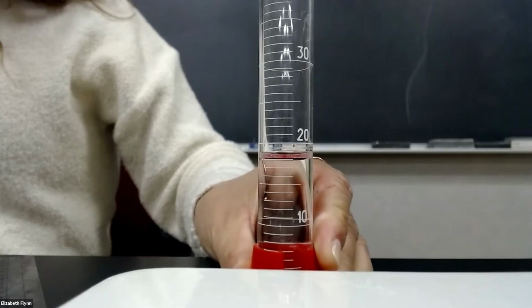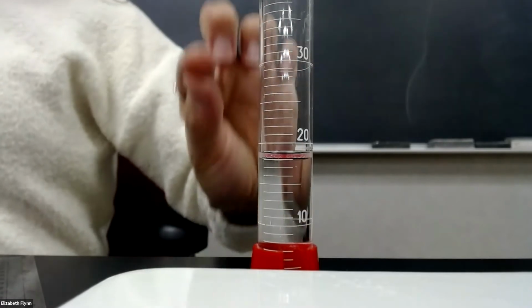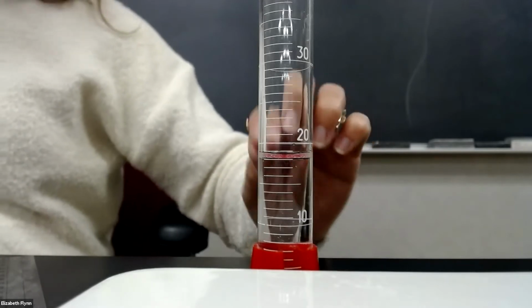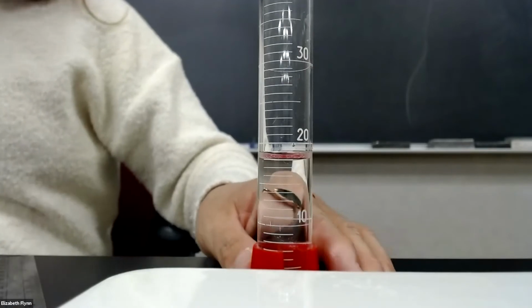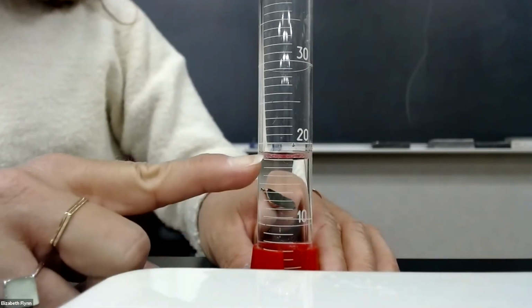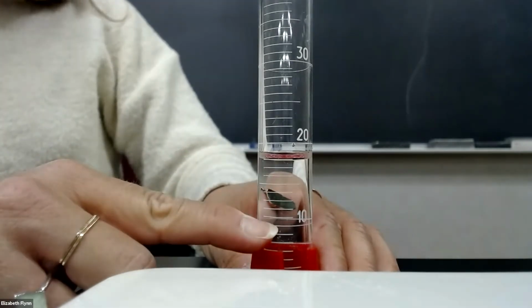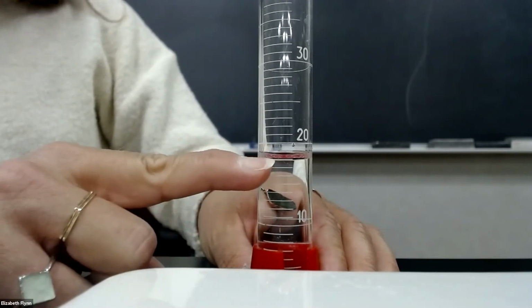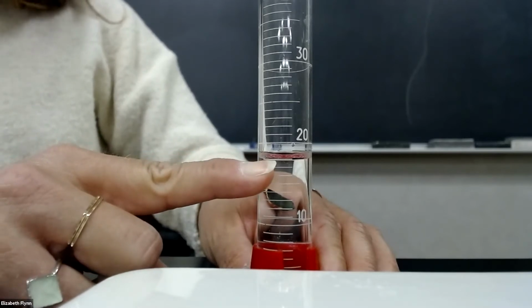Now we're going to measure the volume of water in a 50 milliliter graduated cylinder, right? Graduated, meaning there are lines, there are measurements, there's indication of the volume. And it's a cylinder because it's long and skinny and cylindrical. All right, so now we're still going to be measuring to the bottom of the meniscus, but now we've got extra lines. Here's 10 milliliters right here. Here's 20 milliliters right here. And remember, we always want to be at eye level. So I've set this up so that the bottom of the meniscus is at camera level. So that's what we want, at eye level.